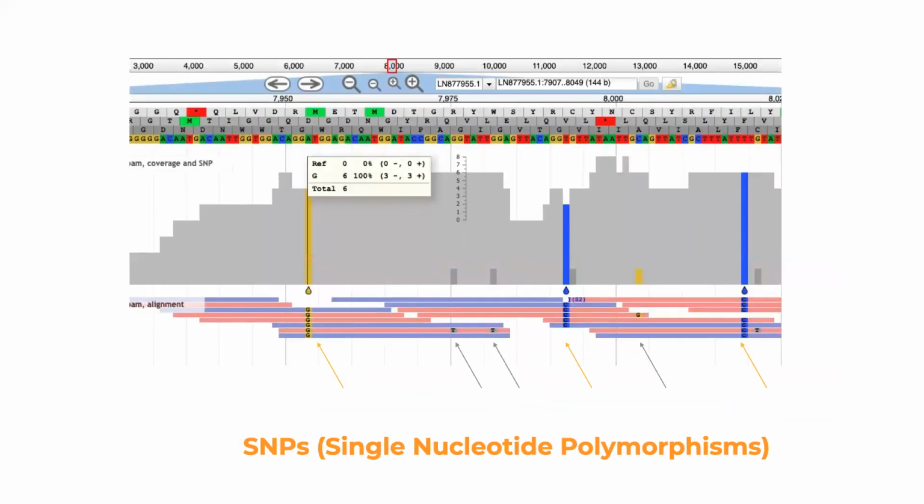Okay, so here, when we look at the number of variants present, they will have different confidence levels. Some of them that appear across all of the reads consistently, we are fairly sure that that's what they are. Some of them are really probably mistakes or rare variants. Again, remember that the sample typically contains a huge number of genomes actually present.